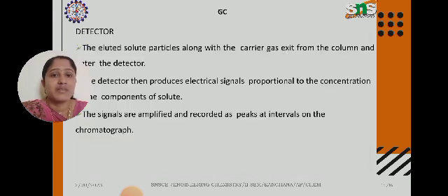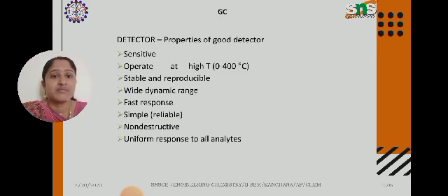Detector. The detector produces electrical signals proportional to the concentration of the solute components. The signals are amplified and recorded as peaks at intervals on the chromatogram.